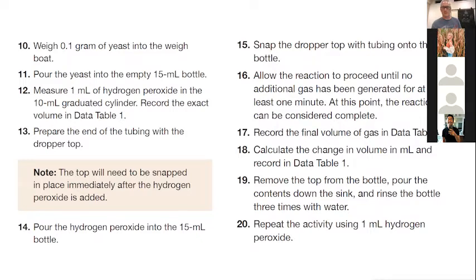What do you think? What's the yeast doing for us? Is it part of the reaction? When we balance this reaction, is yeast a part of it?